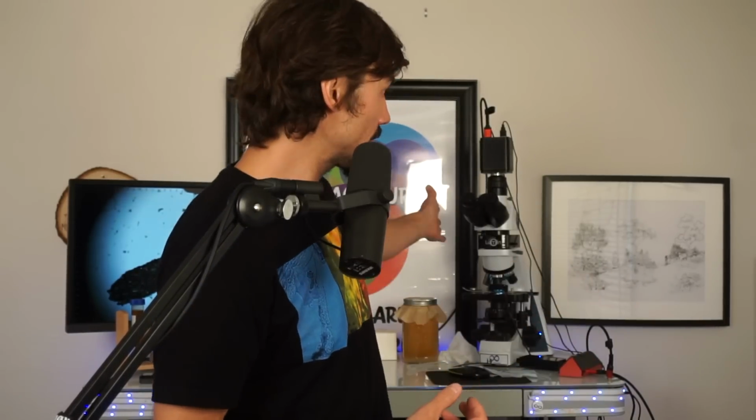And then when I learned that this was out of range, I was upset. And then I was like, I don't care, I'm going to figure it out. And I ordered it. And then I started playing with it, and then figured out that everyone who made those things about how it's out of range was using eyepieces.